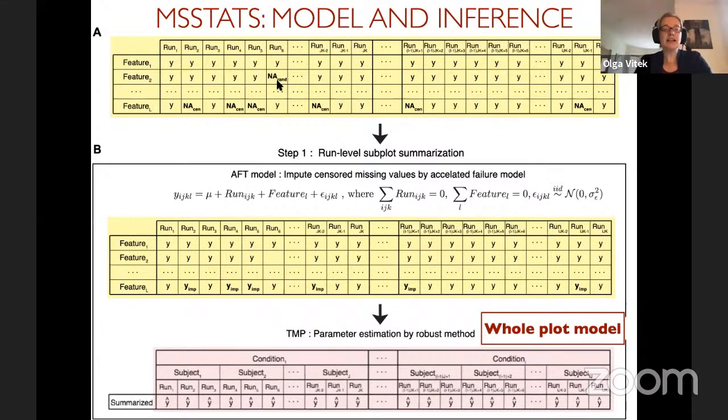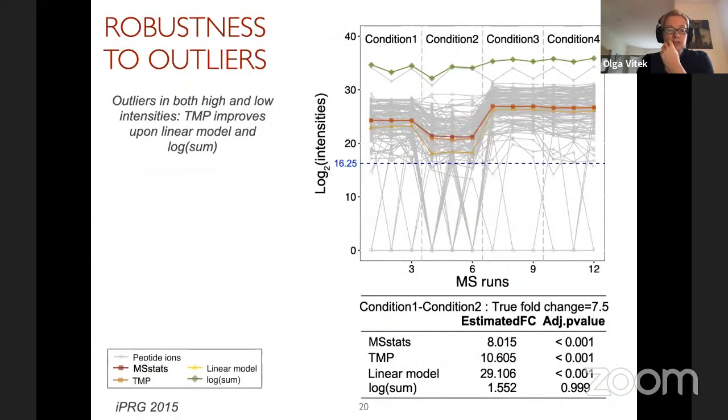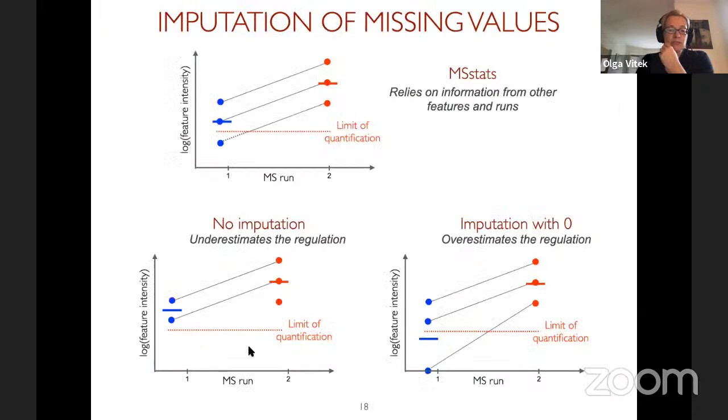So for example, Skyline uses NA only when it cannot reliably quantify a peak. For example, if the 2 peaks are present, but they overlap so much that you cannot report their intensity reliably. Or think of a scheduled SRM where the peak moved outside of the window. So you kind of see the peak, but you don't have enough information to actually quantify. So Skyline specifically uses NA to indicate those. And so in this case, it is not appropriate to assume that they're censored. So we leave those as missing, because we think that they are random, so essentially we treat them like that. We will just ignore those values.